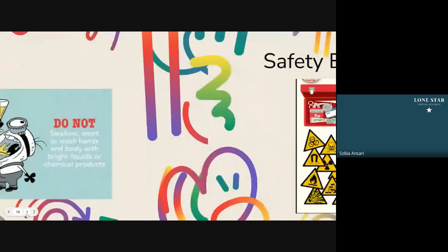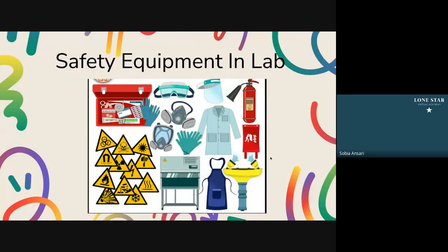All right, the safety equipment in the lab. This is a fire extinguisher. It is used to put out fires. These are going to be fires on a desk or a table, chemical fires that are away from people. So you do not use a fire extinguisher on a person. A fire extinguisher cuts off all the oxygen, which is what puts out the fire. If you cut out the oxygen, it's going to put out the fire.